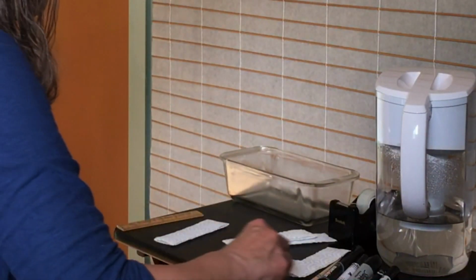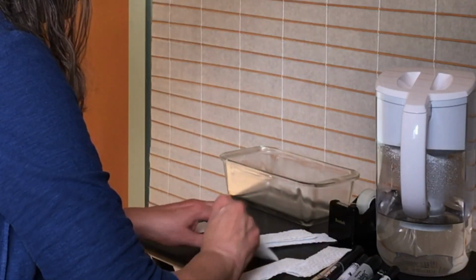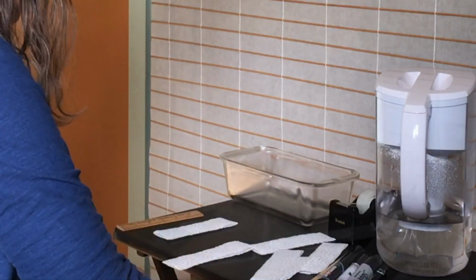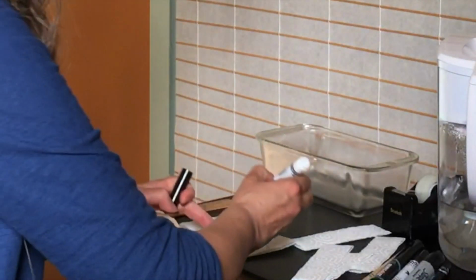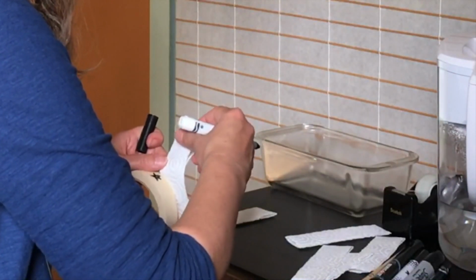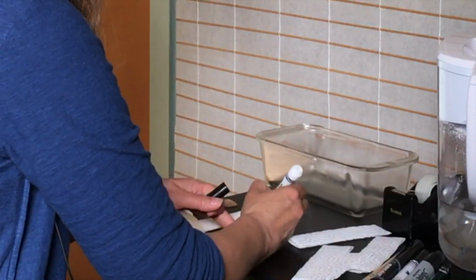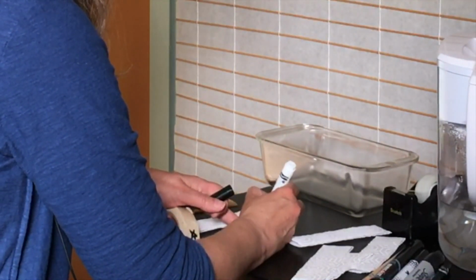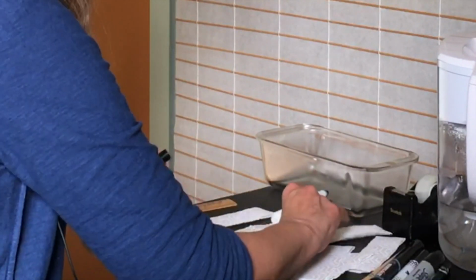So we are going to mark the pen and the strip. So let's start with this one. Let's make this one a star. We'll put a star on the pen and a star at the top of the strip. You could use letters or numbers. That would make just as much sense.